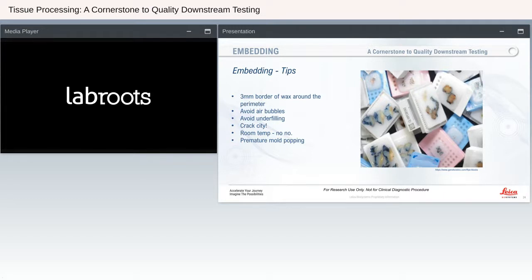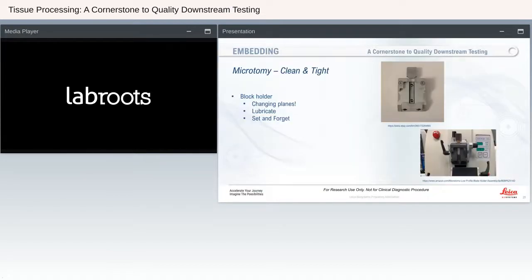It's on the opposite side of that. It's not good to let those blocks just solidify at room temperature. You definitely need your chill plate on or have an ice tray out that you can use. Of course, I've done this being in a hurry. We try to get our molds out quickly so that we can go ahead and section and get done. But premature mold popping certainly sometimes will leave some of the tissue behind in the mold if it's not ready.